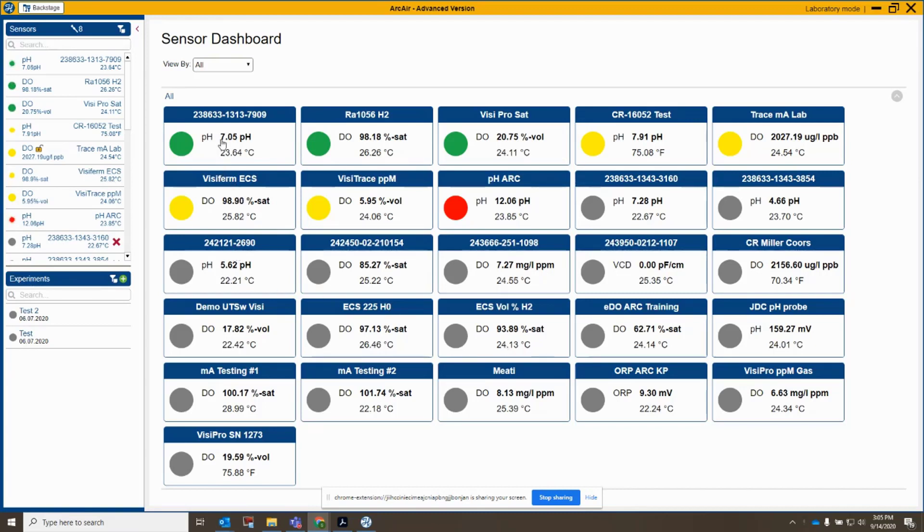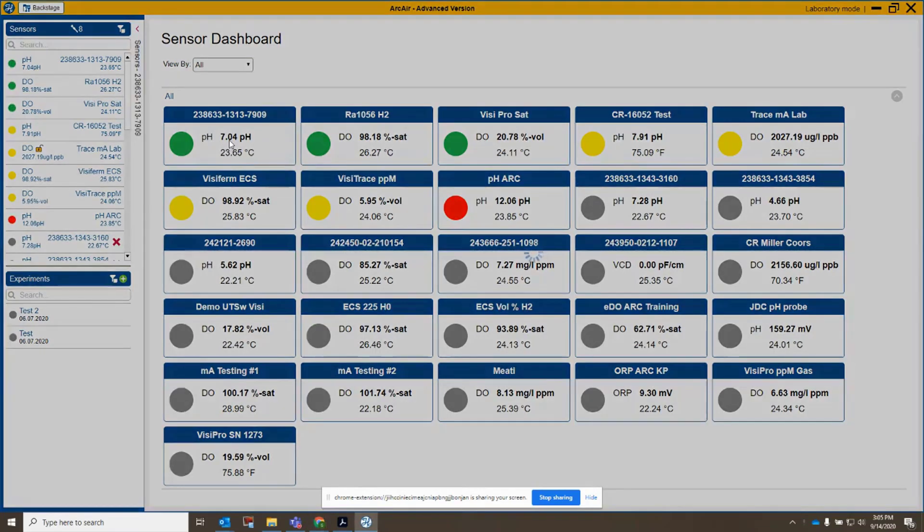We're going to use this sensor in ArcAir right now. It's reading pH 7.05 and 7.04. It's sitting in pH buffer. So let's click into the sensor and see what we've got.